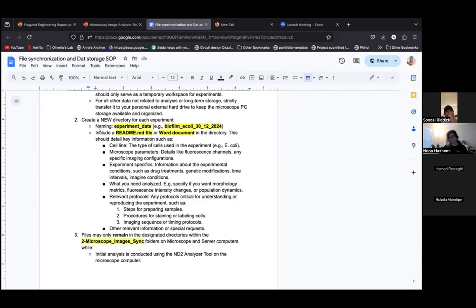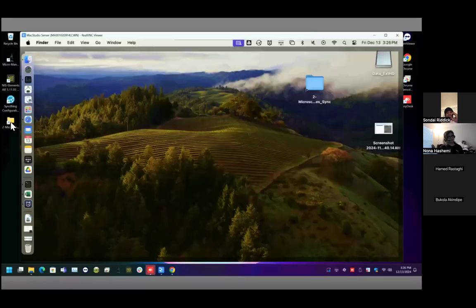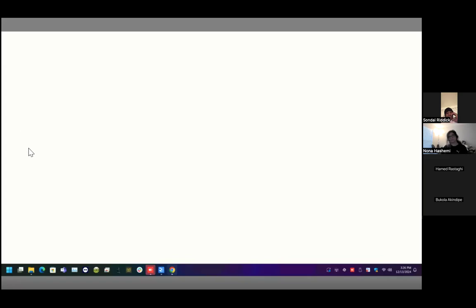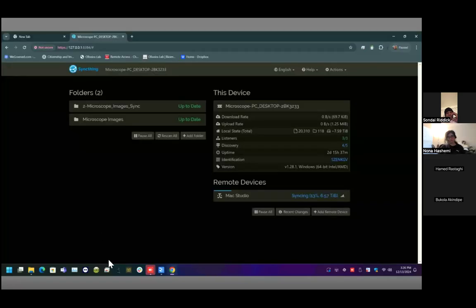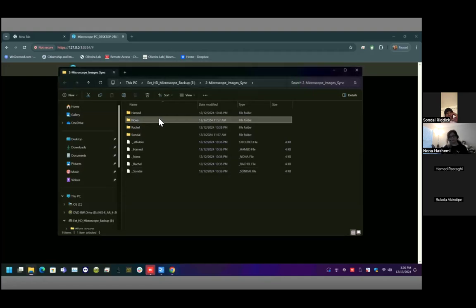All right. I'm going to create a file now, and I'm going to name it this. It's just going to be a text file, and this is going to happen right inside here. I'm going to be creating it inside the folder.